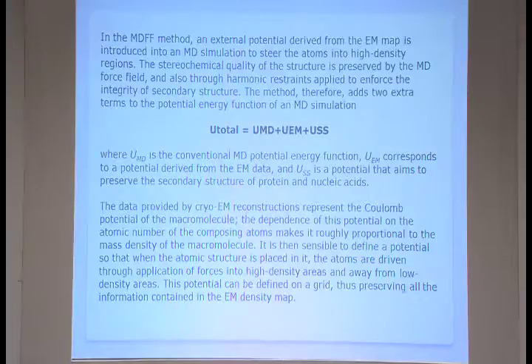You can just make it as a potential, and it's a grid-steered fitting molecular dynamics. This term will force the structure to go into the highest density region.